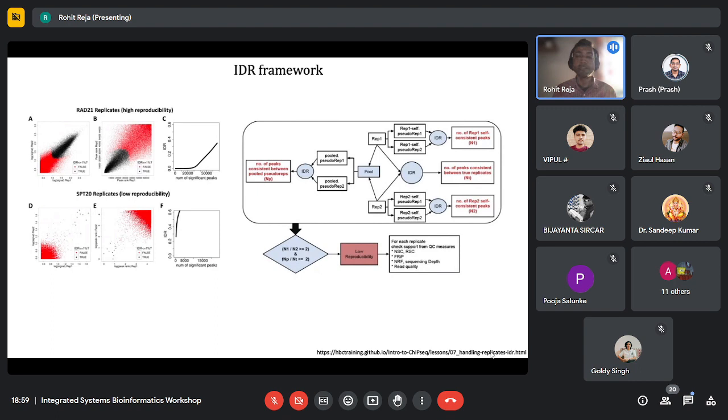They would probably appear in both pseudo replicates as well. So you make these pseudo replicates, do this IDR calculation, and get another metric. Thirdly, an optional step is to take a replicate itself and split it randomly into two replicates, and then calculate this IDR metric as well. Basically the same concept: the high intensity peaks will be the same, and you'll get another metric.